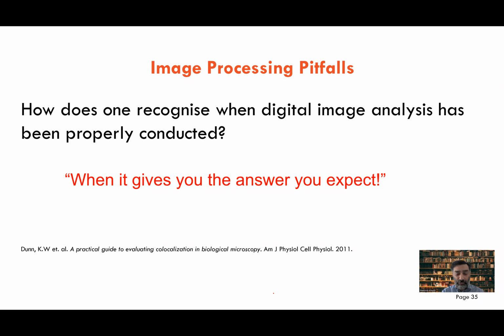We as data scientists don't hide the dirt under the carpet, and at the same time, what's visible, we just try to show that the pattern was in the data. We don't create the pattern. We just highlight the pattern that's available in the data. Right? So I hope this makes sense.